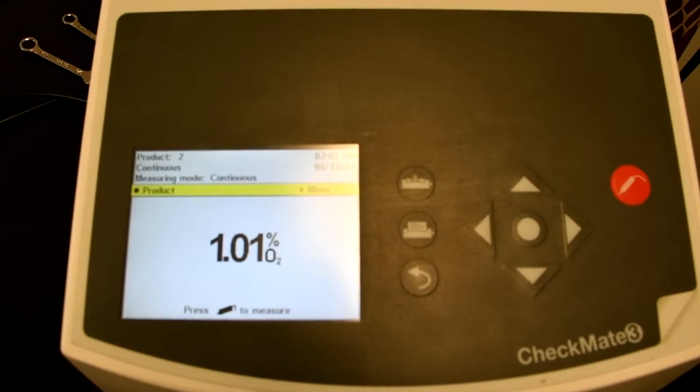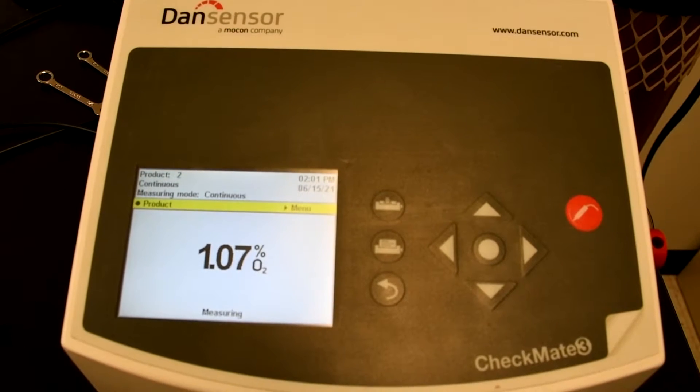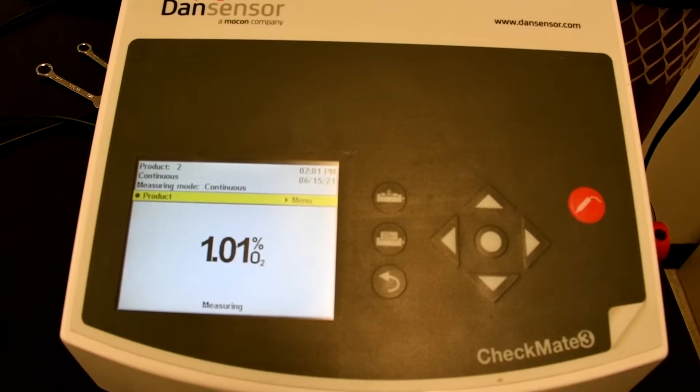Set your Checkmate 3 for the continuous mode. Take a measurement with your instrument. When the reading on your instrument stabilizes, press the Stop Measurement button.